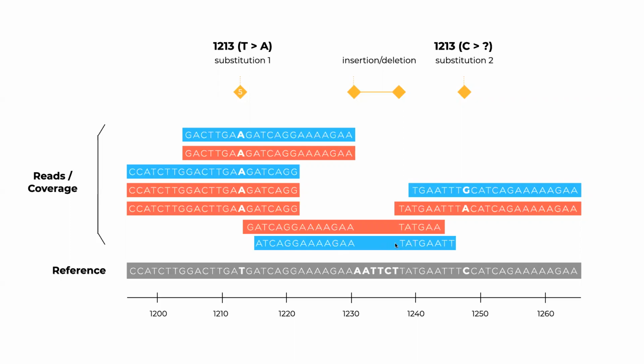Certain nucleotides are missing. So obviously this is an artificial example, but it shows you how important it is to have significant coverage. For example, for whole genome sequencing, the rule of thumb, if you're interested, is 5 reads per base. So you need to have at least 5 to make a determination that is somewhat significant in terms of a DNA reference genome.